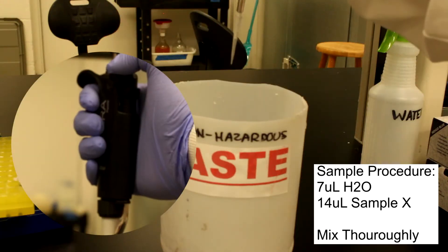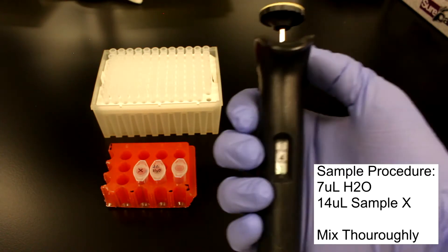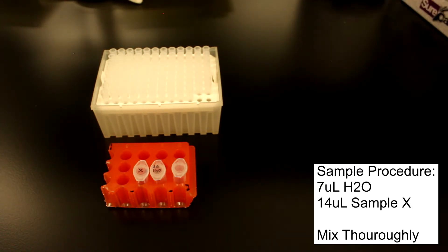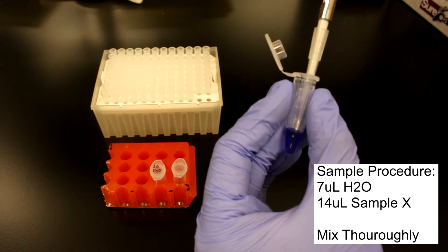The tip is then ejected from the pipette into a waste bit. The example procedure then requires 14 microliters of sample X. 14 microliters of sample X is transferred into the mixing vial using the same method.